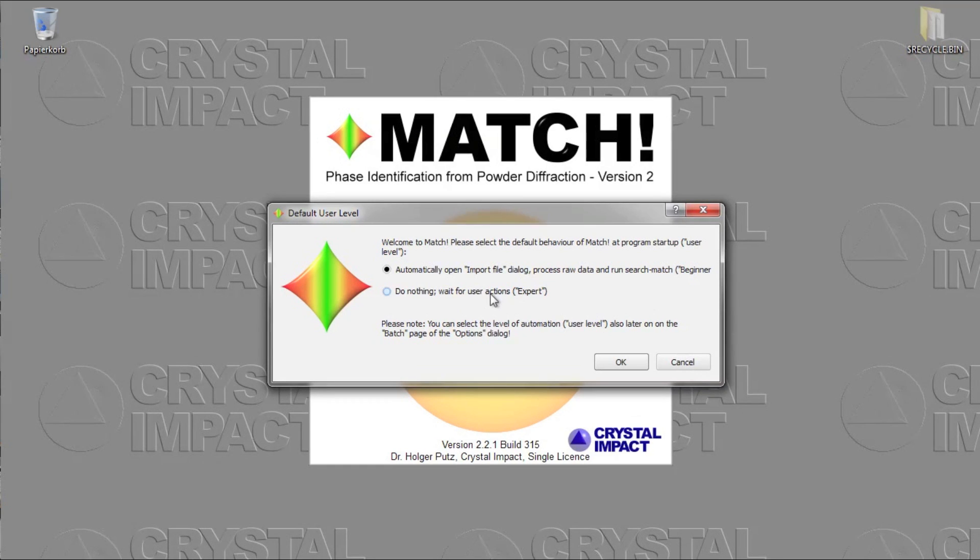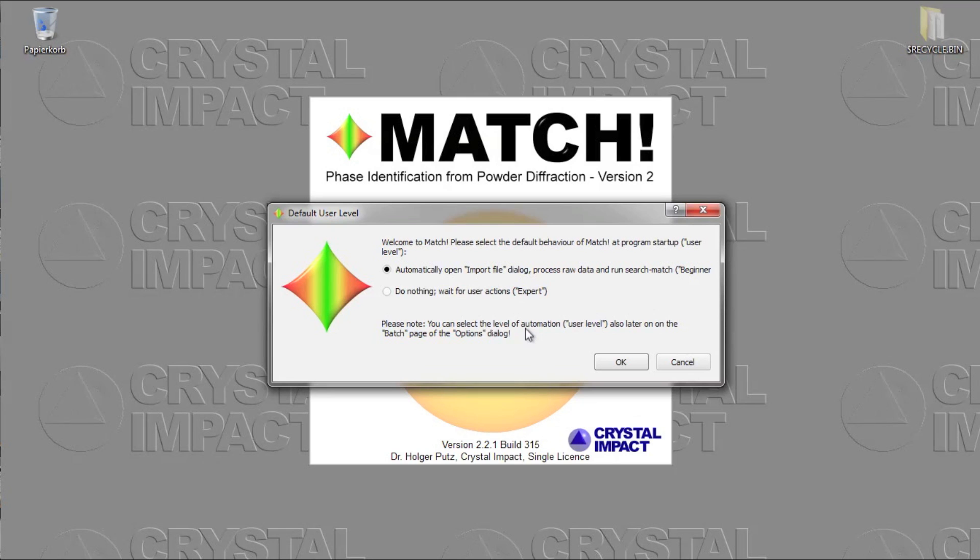But this assumes that you are already familiar with the software. You can change the behavior of Match also later on, so you shouldn't worry about that at the moment too much. Let's just click OK here.